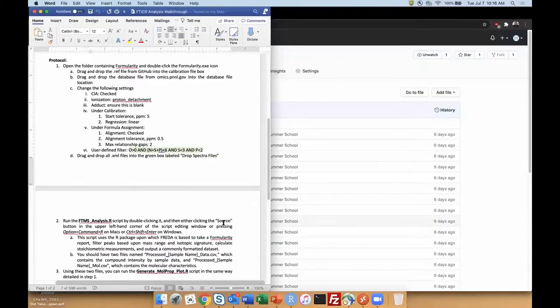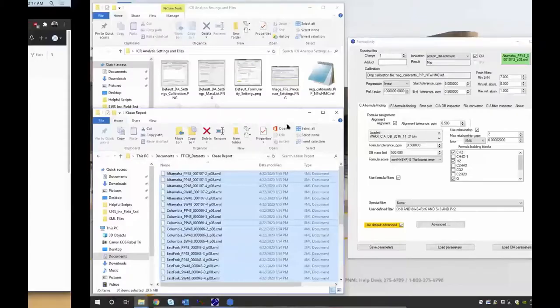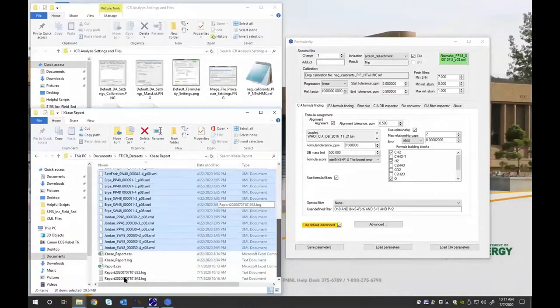That's usually an error that happens when there is no data. Because usually the only sample that ever has any problems that we've added a deviation from our sample analysis is, yeah, look at that. Yeah, so okay, we can troubleshoot this live.